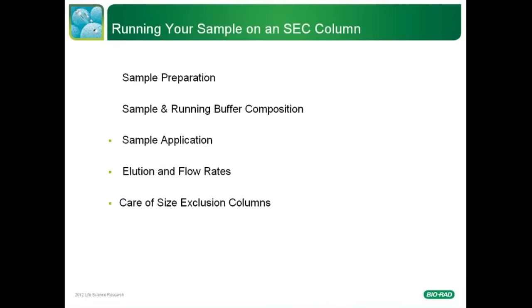Okay, now for this part of the talk, I'm going to review running your sample on an SEC column. How do you prepare your sample? What are recommended buffer and running conditions and flow rates?